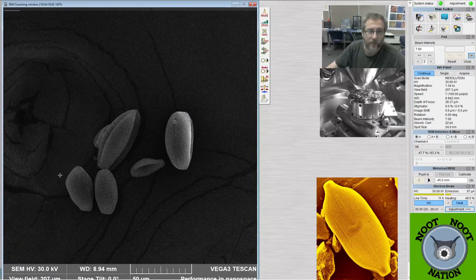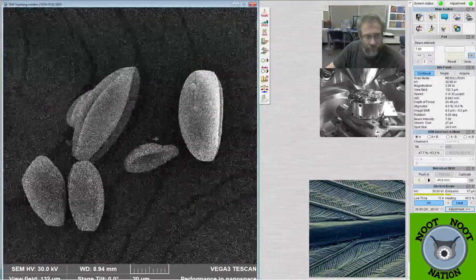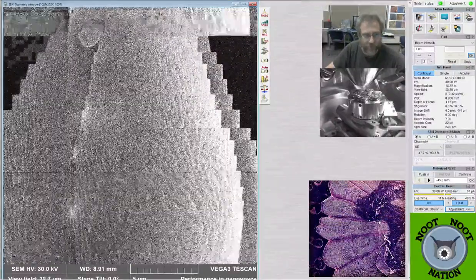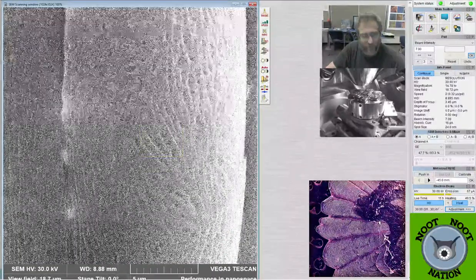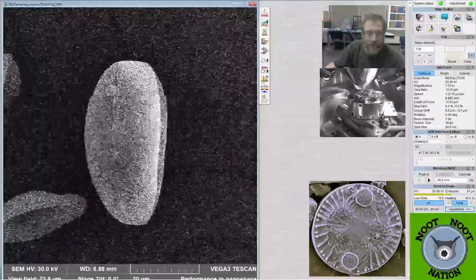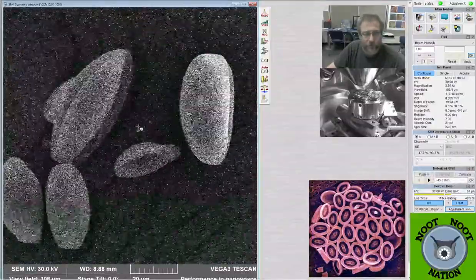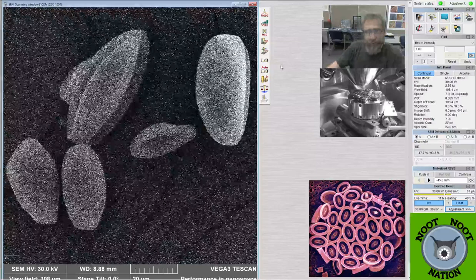So, and then once this image seems like it's going to work, I'm going to get it at the elevation that I want. Double check the focus. I think maybe I need to zoom in on that, because it's got really unique texture to the surface of it. It's a little charged, but I think it won't matter because I'm zoomed back out. But we should be able to see that detail. And then I can come back to chat and see what's going on.